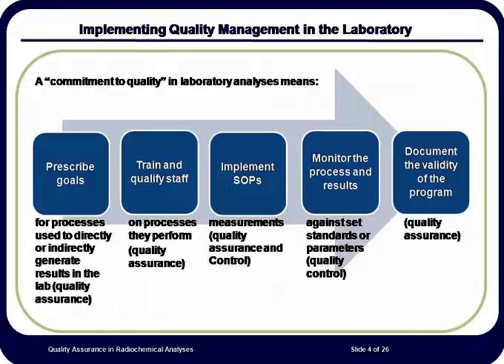The figure on this slide provides an overview of how quality assurance melds into quality control. The management of the process needs to be established in a written document that is specific to the laboratory. The Quality Assurance Plan, or QAP, for each laboratory should identify each of these processes, as well as others, and how they support the overall product of the laboratory, data. Each member of the laboratory should understand the connection of each of these parts of the process to the overall production of the data.